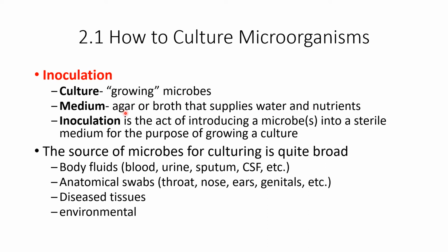Agar, as we're going to see, is kind of a thickened water. Think jello. But this is made from agar, which originally was a seaweed extract. We're going to supply all the water a living cell will need and any of the nutrients. The inoculation here is taking a microbe and introducing it to an agar or a broth so that this microbe can grow, increase in numbers.